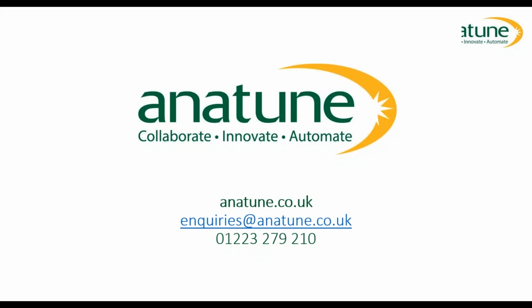Excellent. There's also a question here about whether you can use toluene. I think this must refer to soil, as toluene to extract volatiles. Is that a possibility with SIFT-MS? No, short answer. I'd agree. Well, yeah, the short answer is no, because too much VOC. Could we do it by some other approach? I don't see it. Toluene is such a nice VOC for SIFT-MS that you can see it at parts per trillion. It wouldn't work.